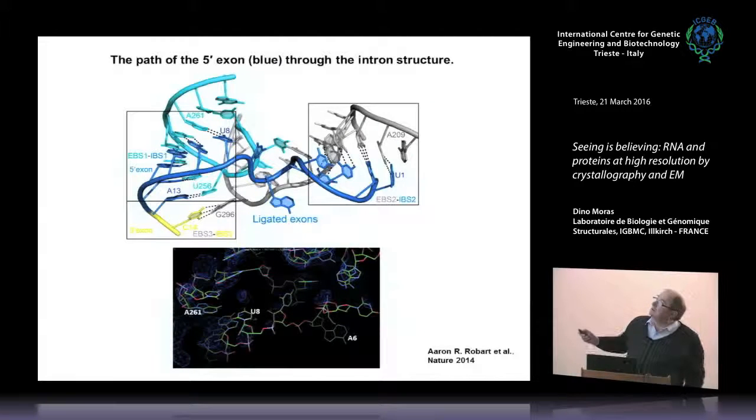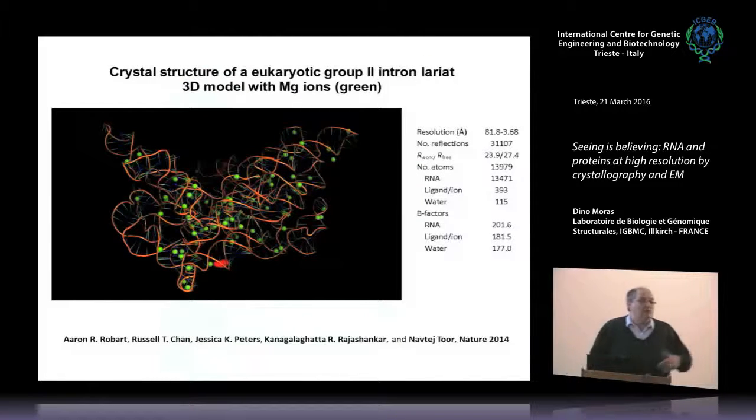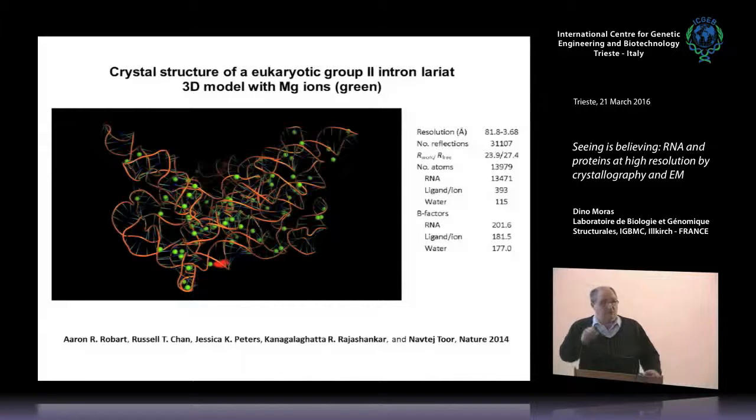That's a critical part, the exon. Here is the exon, how it is built. Every time, you do the same experiment and you look sharply for your density. There is none for most of it. So again, even if the result is important, you have to look at the critical part. What is the question? What is the experimental answer? If it is not provided, and usually it is provided in most good papers, if there is a problem, you go back, because the data have to be provided. And when you see things like that, you better look carefully.